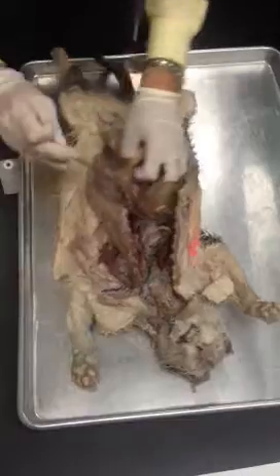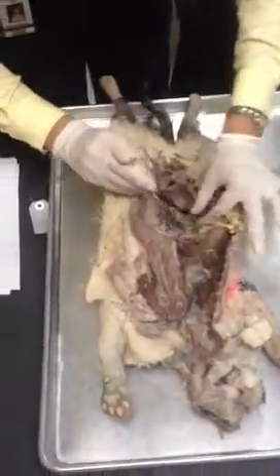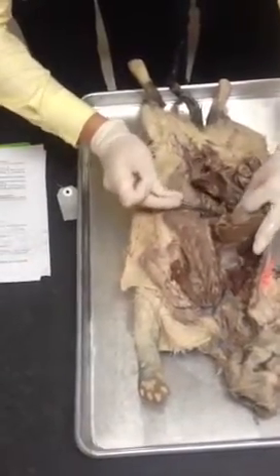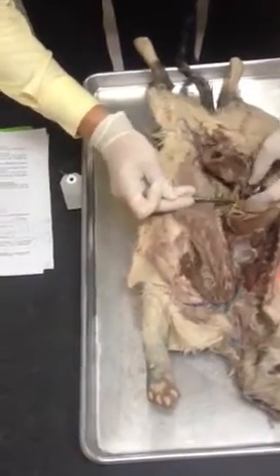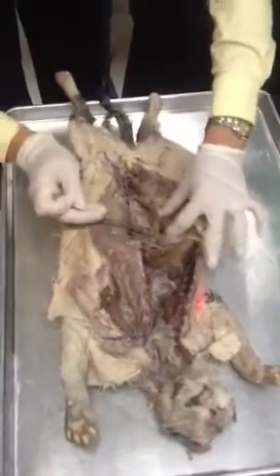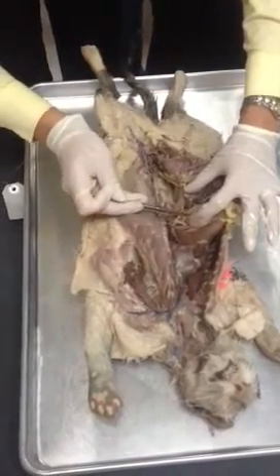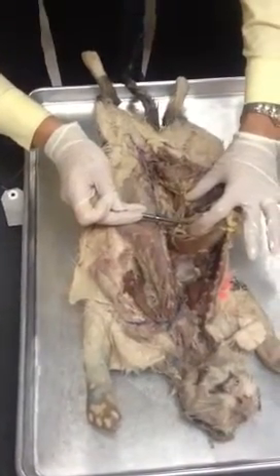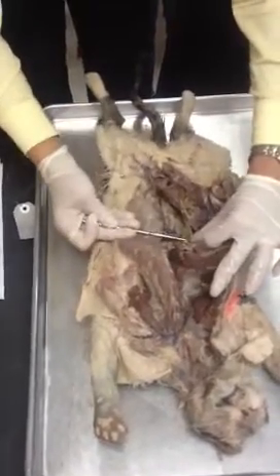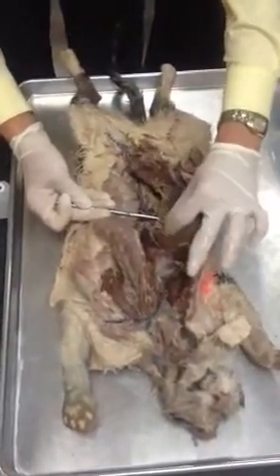If I can dig it out here somewhere. All right. If we pull this up a little, you see how here this will be the right superior mesenteric, and this is a gastric, and there is a duodenopancreatic, and they go into here under the probe. That would be already the hepatic portal vein, right? That continues towards the liver.